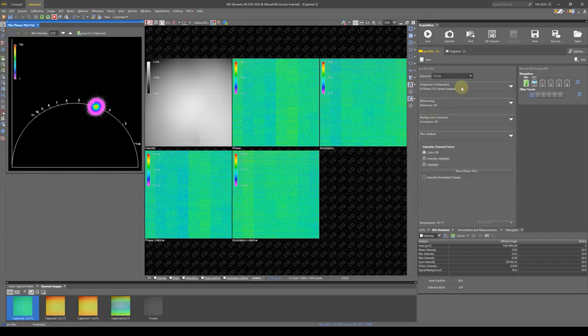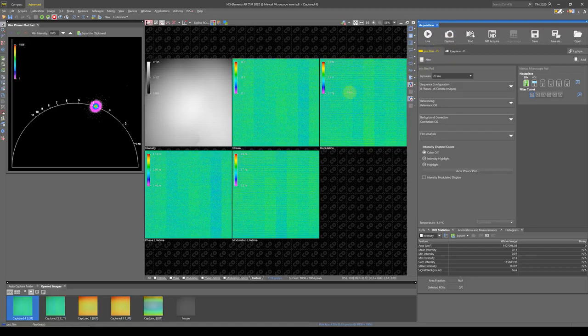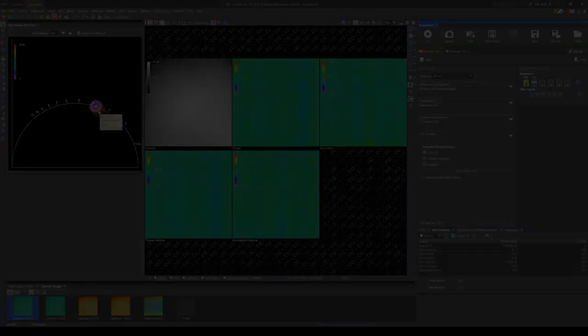Then you might want to have a look at a little larger signal, because then at 20 milliseconds I would expect with the next measurement that the circle of the noise around these 3.7 nanoseconds becomes smaller, which is the result. So this looks like a good reference measurement, and now with this reference measurement you can take as many real data measurements as you like. Now we've done a successful referencing, and we can start with the measurements.